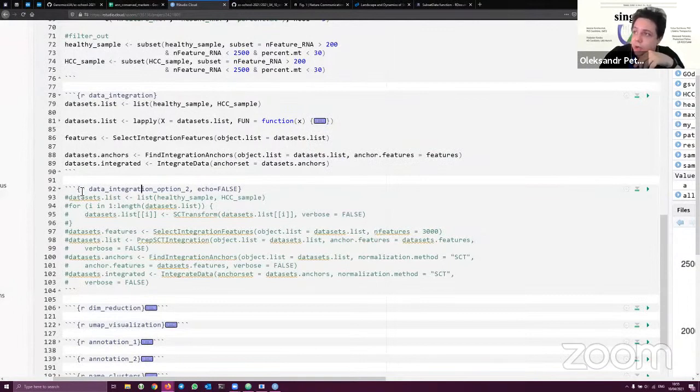However, I also put the second option here because for my personal analysis, I don't use log normalization that much, because there are better options for data normalization in my liver data sets. However, it's very resource dependent, and even 8 gigabytes of RAM should not be enough, or usually it's not enough for such normalization. The name is SCTransform, and there's a paper, I think from 2019, published about it. So it's a little bit more sophisticated method.